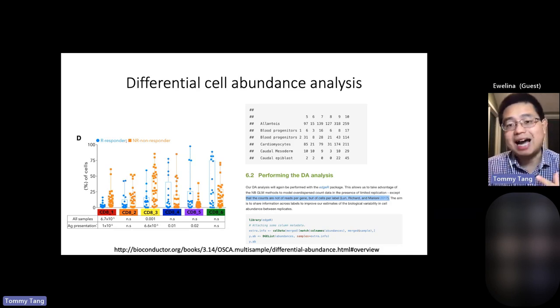Also, cells can die during preparation. Myeloid cells are sometimes hard to dissociate. In one of the Hodgkin lymphoma data sets, we actually found very few myeloid cells. We figured that was a technical issue. But it might actually be reasonable for PBMC data from a blood sample, because it is supposed to be all homogeneous cells.